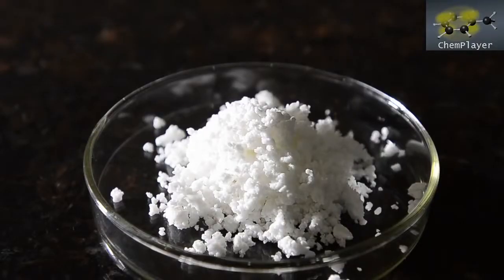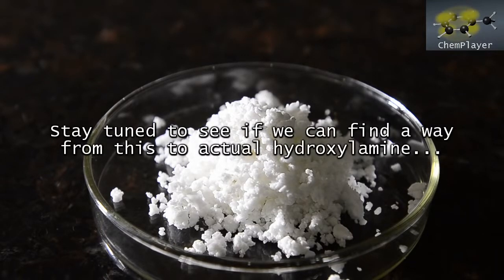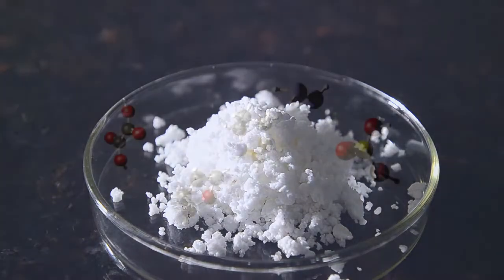And going via this potassium salt rather than directly to an oxime is probably going to be easier as a potential route to hydroxylamine. We'll let you know if we find a way. Stay tuned.